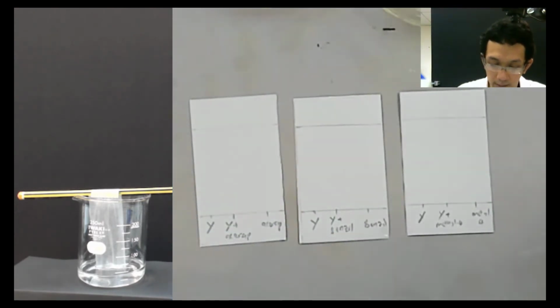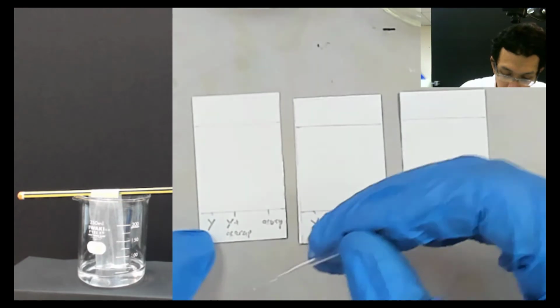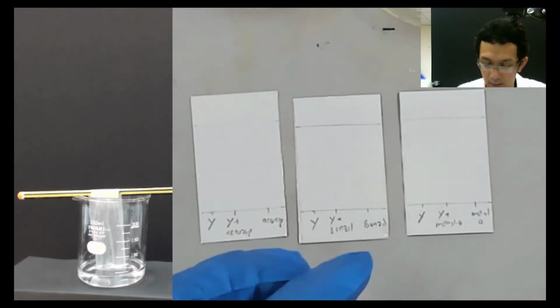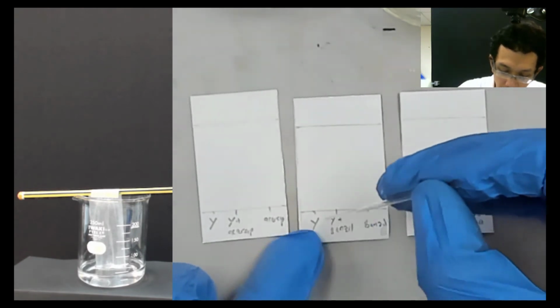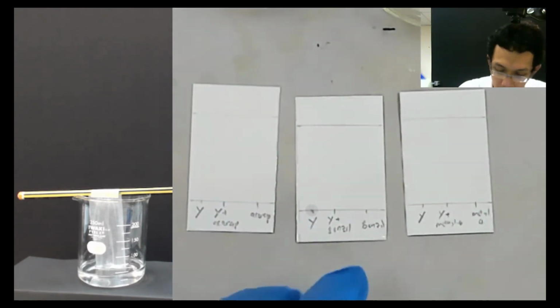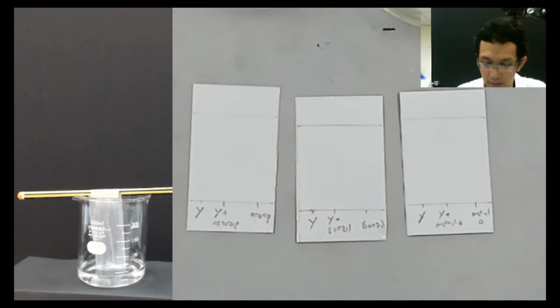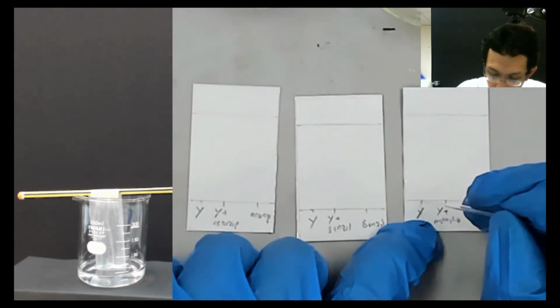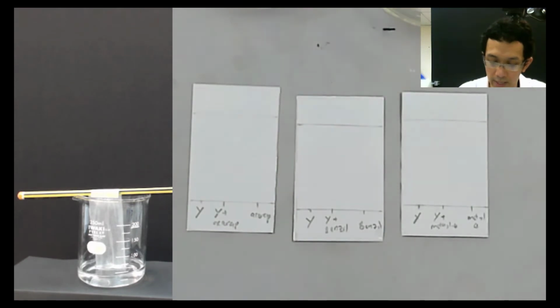So this is Y. I put Y as usual. Put here, and then take one. And then I put here Y. And then I put again here, Y here. And then I want to put in the middle.